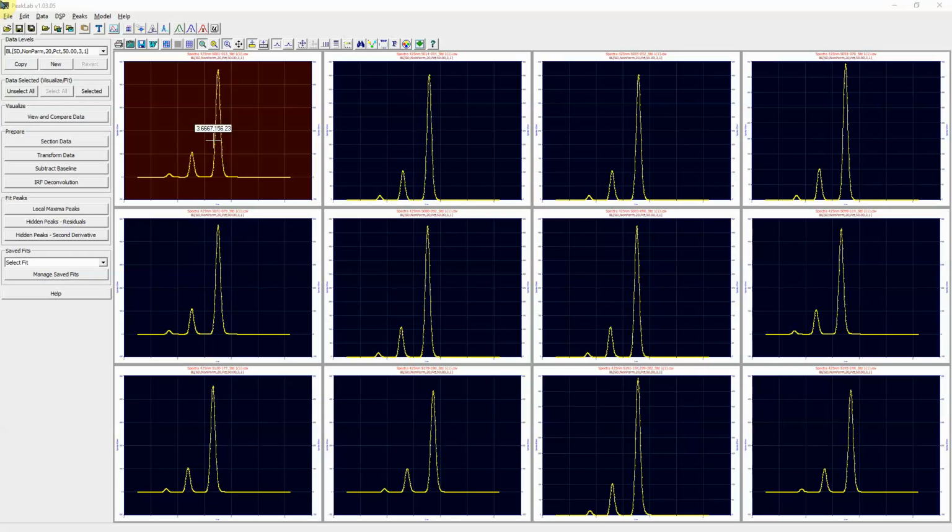For most spectroscopy data, there's a closed-form Voigt that can directly manage the convolution of the Lorentzian and Gaussian broadening. For most spectral data, there's little benefit from a pre-processing deconvolution step.